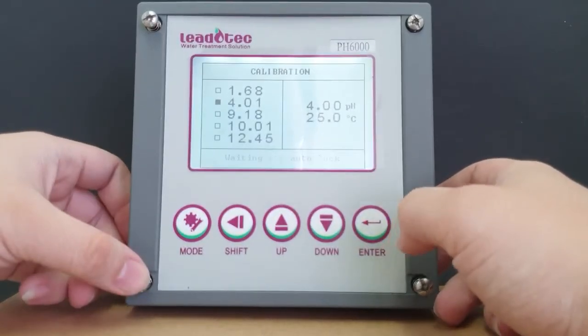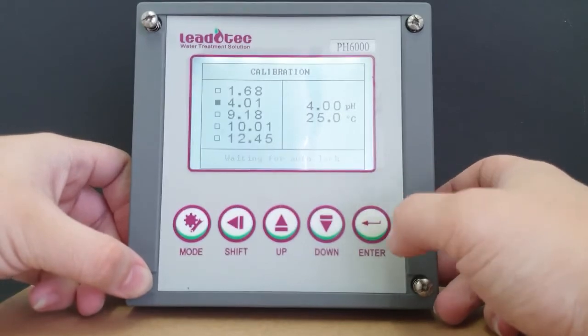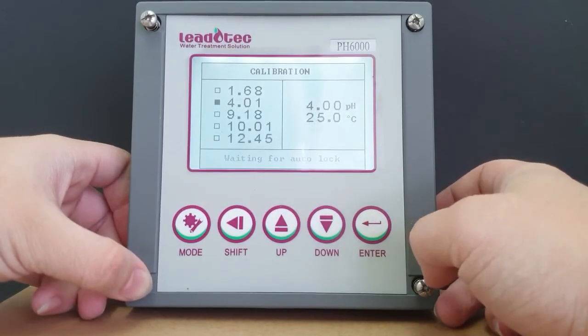Now we can either wait for an auto lock or we can press enter once the reading is stable.